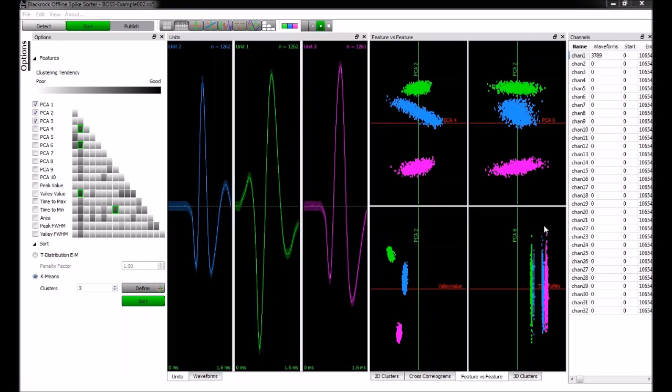So this is actually one we answered earlier by voice, but to answer it again, after you load, detect on and sort a continuous data file, when you go to save your file to an NEV file, BOSS will automatically look for NEV files with the same name, since our data is saved that way.